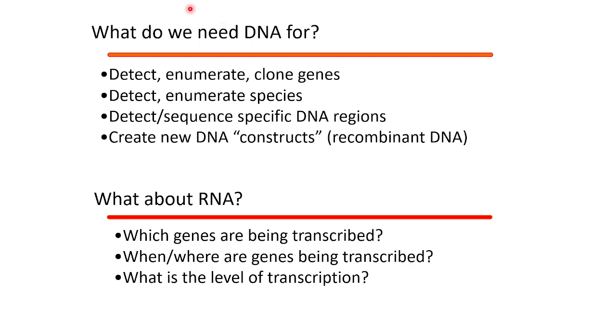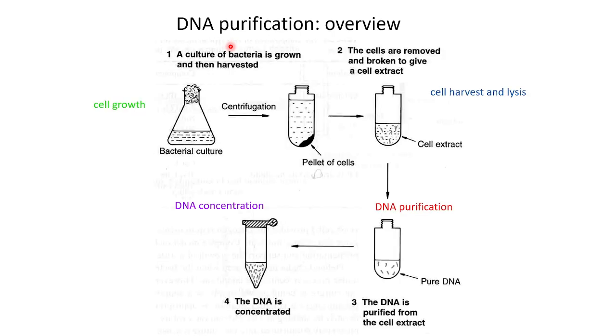So now coming to why do we need DNA, or how can we get DNA. So over here we have DNA purification.